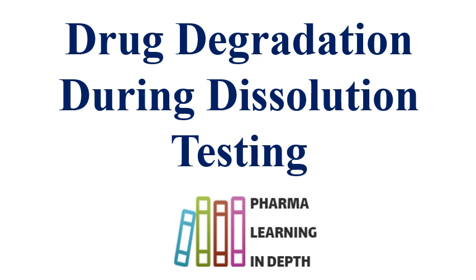At that time you need to justify that the decrease in the dissolution at later time points is because of the degradation. And also in the dissolution method development, the drug stability data can be given. Forced degradation data can be given. Mild degradation data or degradation under mild acidic conditions can be given and supported for justification.